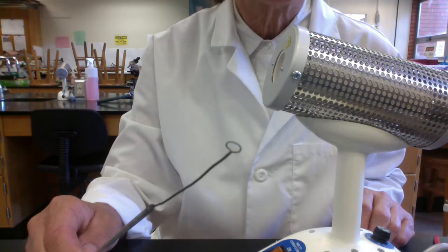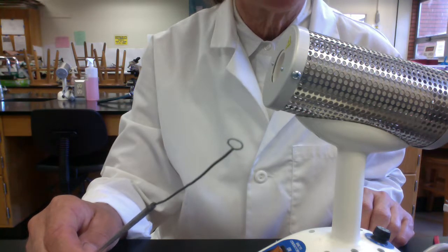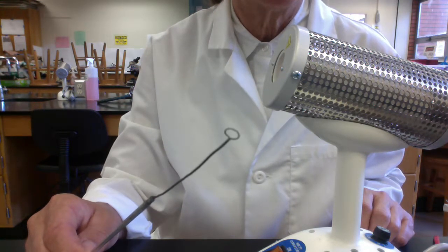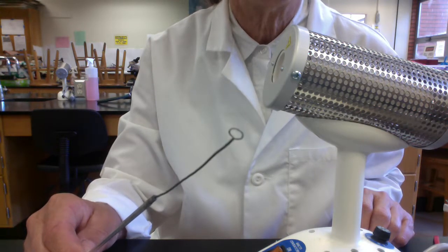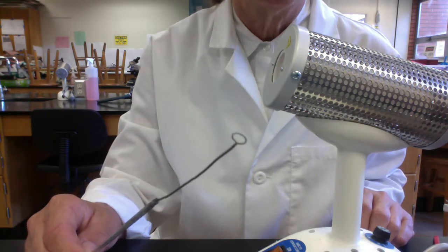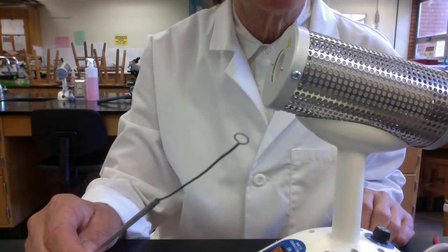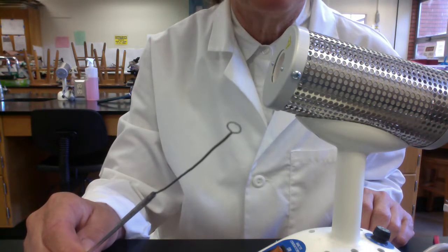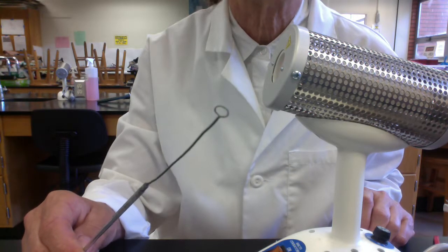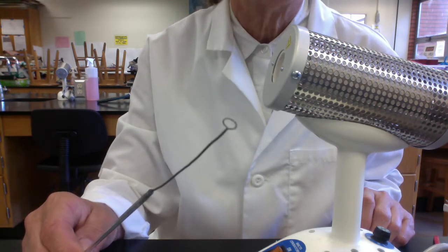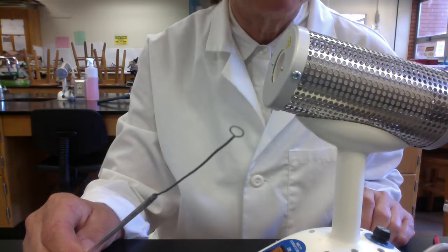And we're so lucky because we now have what I consider much safer Bacti incinerators. In the old days, we would use the open flame of a Bunsen burner. We had more than one fire from our Bunsen burners. We had incidences where people's hair was singed by the open flame.